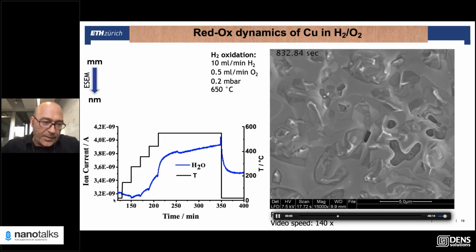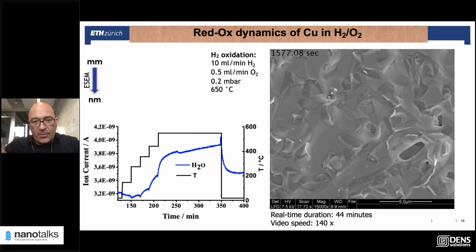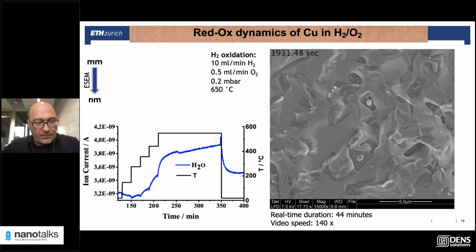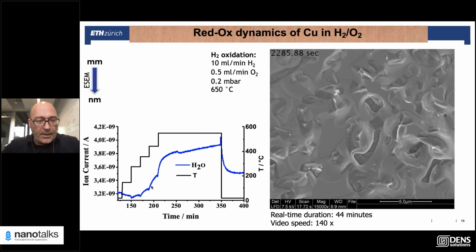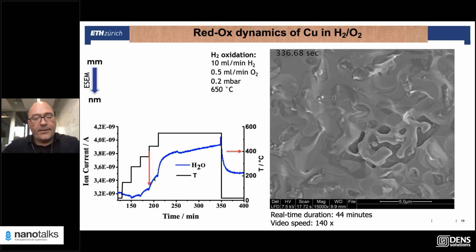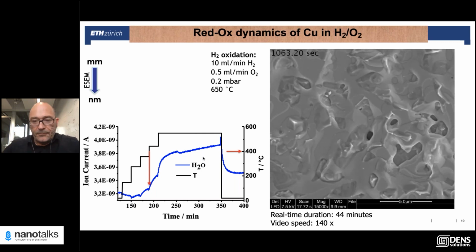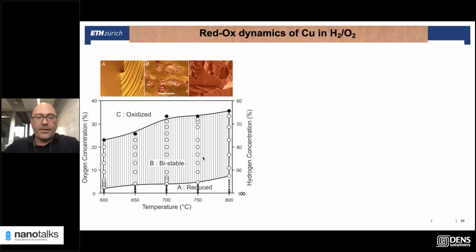Yes, we do. So as we ramp up the temperature in this reaction feed, it's not a very beautiful mass spectrum, I must say, but you see the water signal goes up because of some desorption when you heat up a surface. But at around 400 degrees, we saw that the water formation really rises. So we could see that once the dynamics kick in, we also form water. So these dynamics are related to water formation. Then a PhD student of mine mapped the whole parameter space, ratios of hydrogen to oxygen and different temperatures. And in this whole mapping, we found a quite nice, intriguing regime.